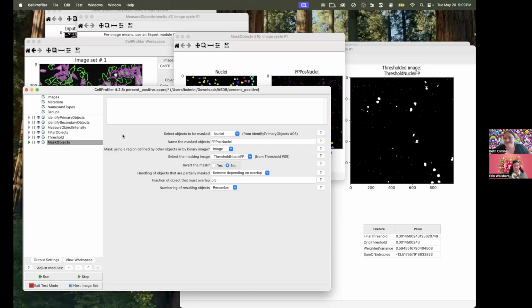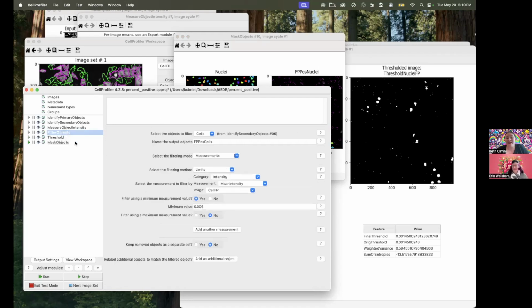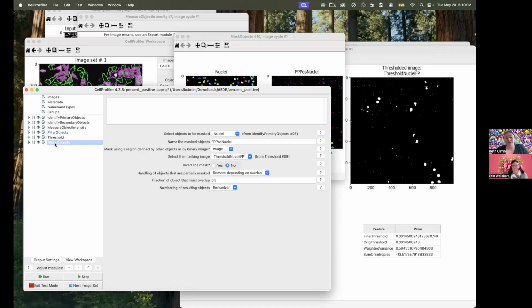Once you've been introduced to this, anybody can replicate it in their own workflow, but an average biologist just starting to think about identifying objects in a quantitative and reproducible manner might not think to piece together these tools in this way. Yeah, and the downside of CellProfiler having so many things it can do is that sometimes it can be hard to figure out the best way. This is a way that will work, this is a totally reasonable way, but this is my favorite way.